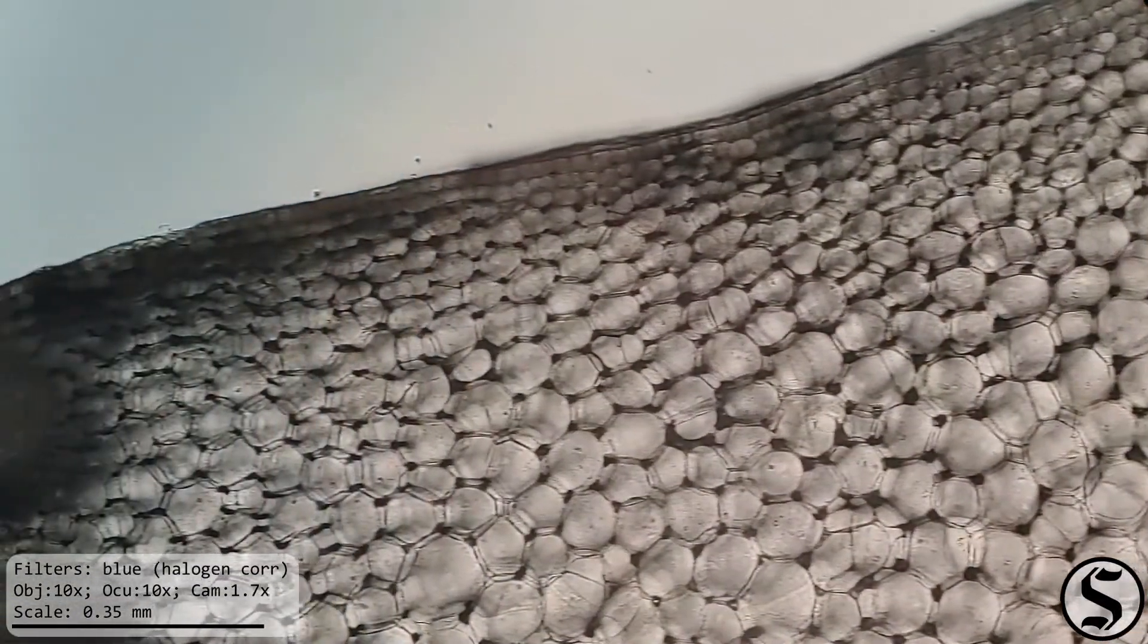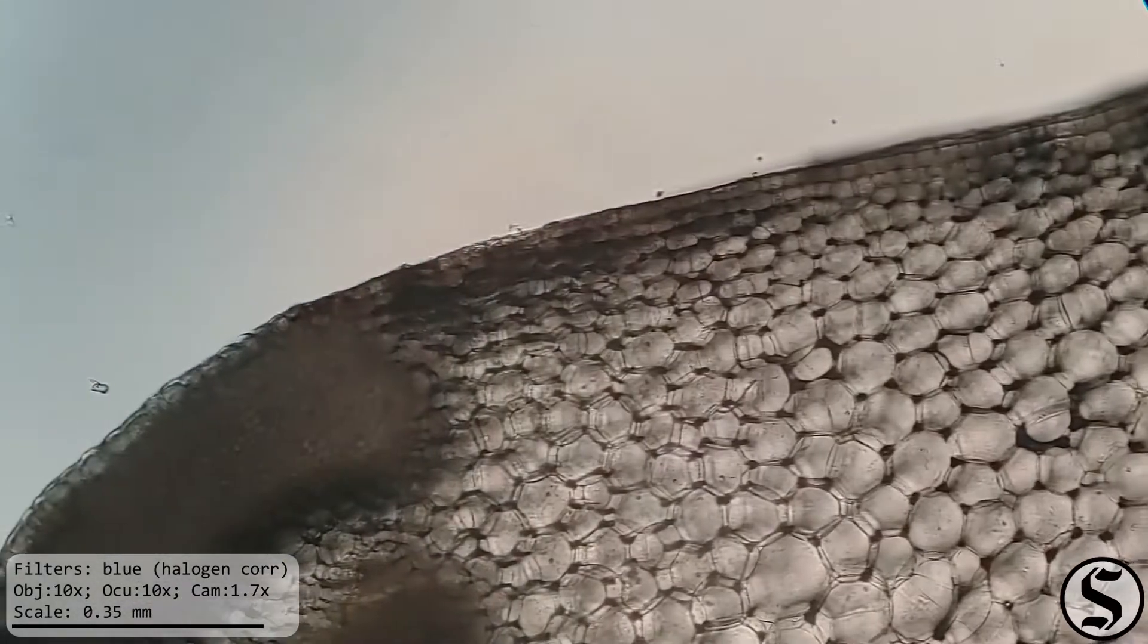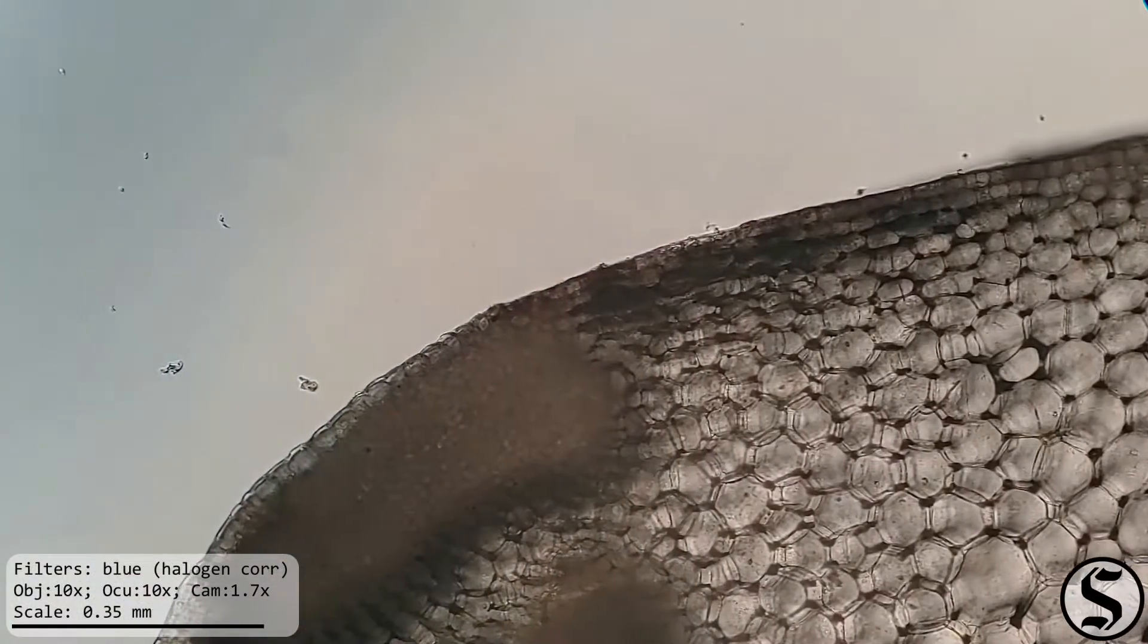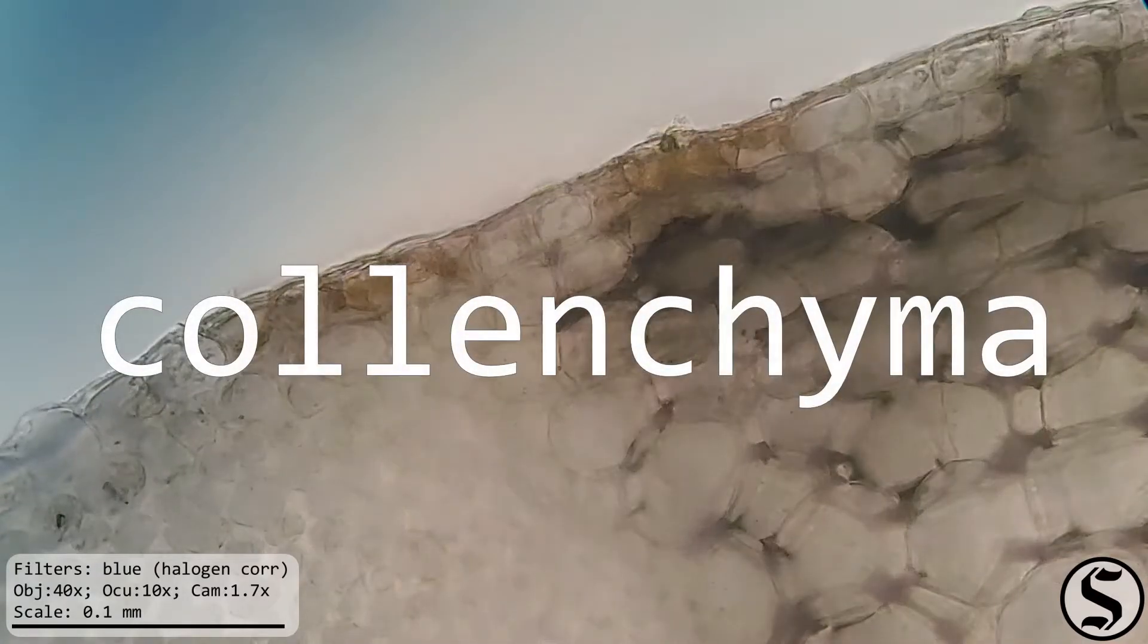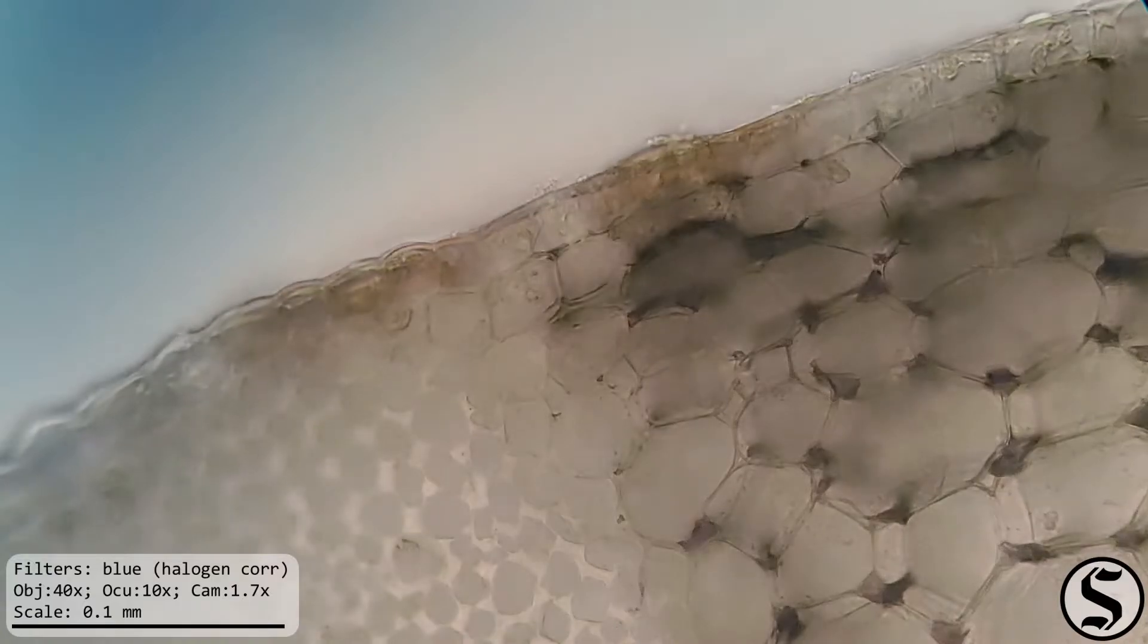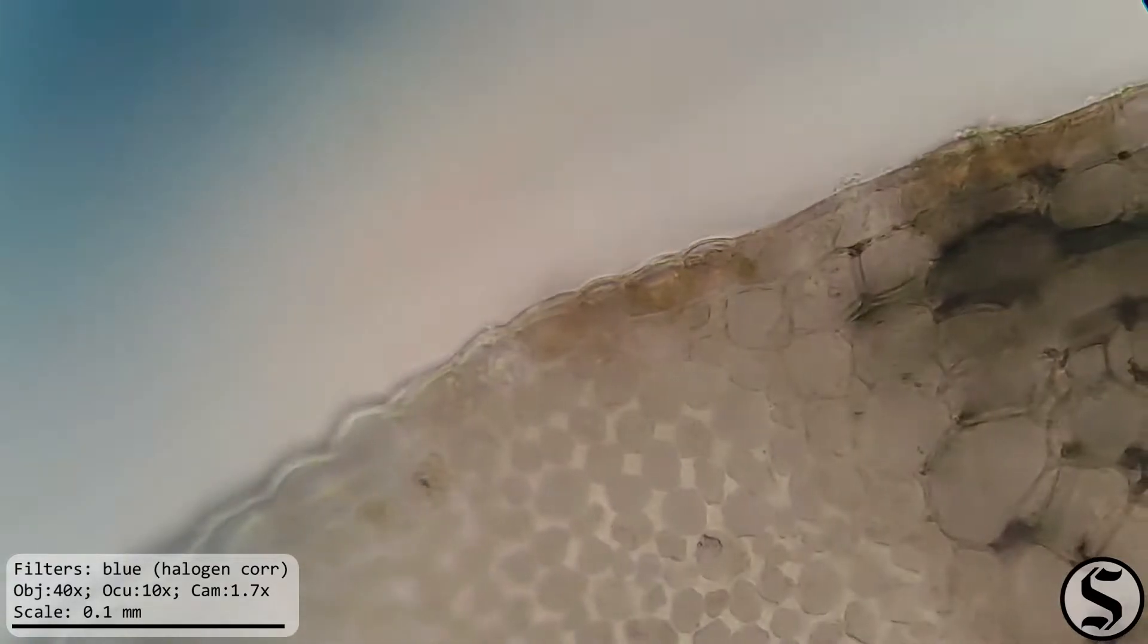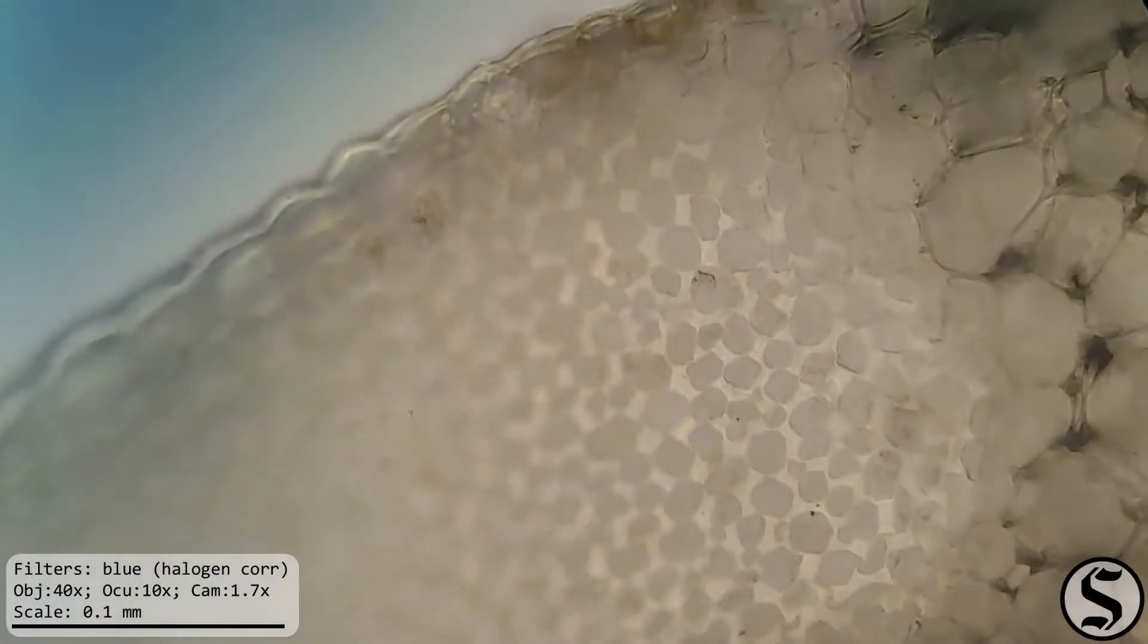And as we go along the celery we can see there's a distinct region of different cells there and that is the collenchyma from Greek kola glue and enchyma filling. And that's the structural support for the celery. That's what all those ridges are along the outside.